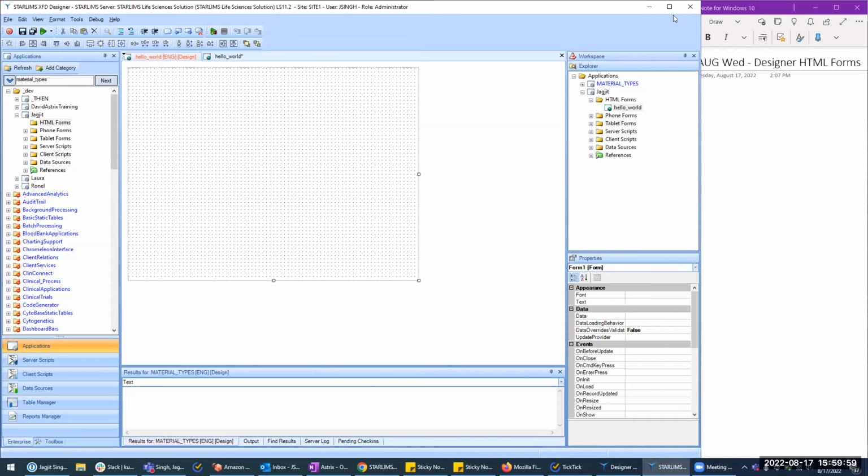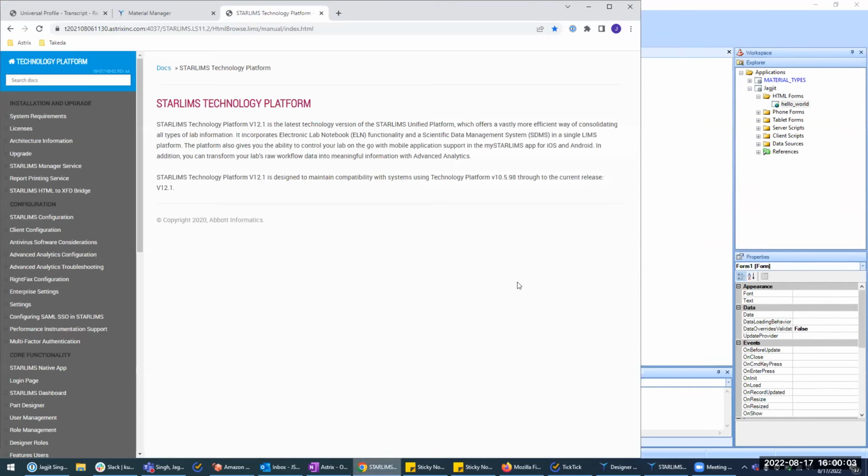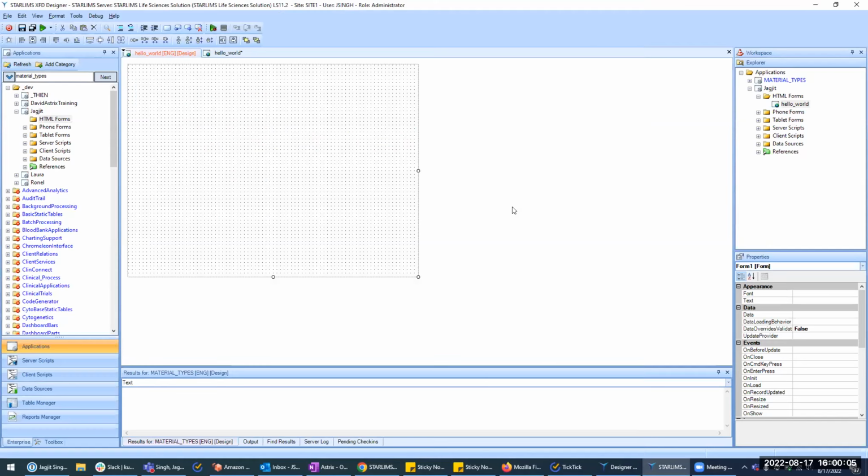MJ? Okay, I'm a little lost with the last step. I have to put in an application. I created one for you, Maria Jose. So I can see it, but I don't see anything in the workspace.